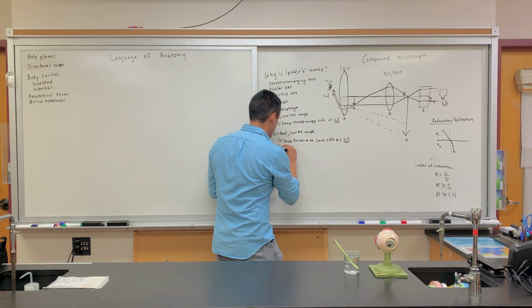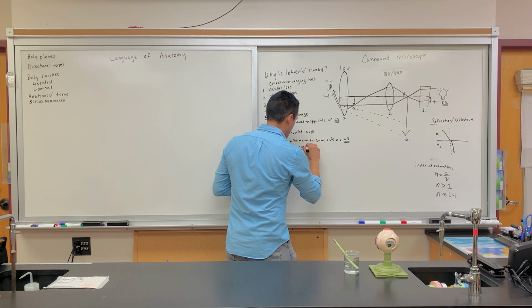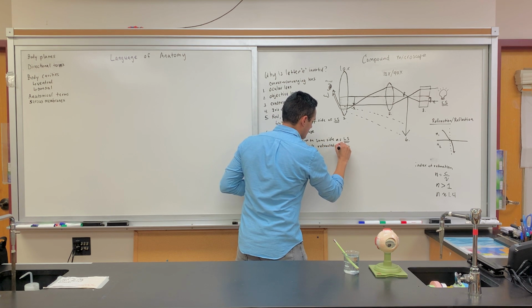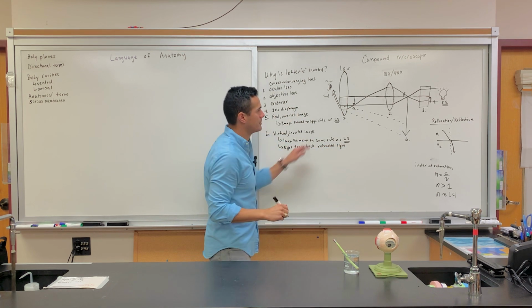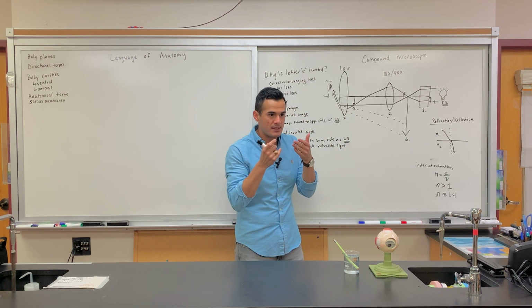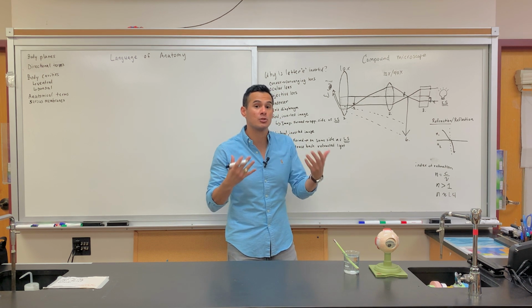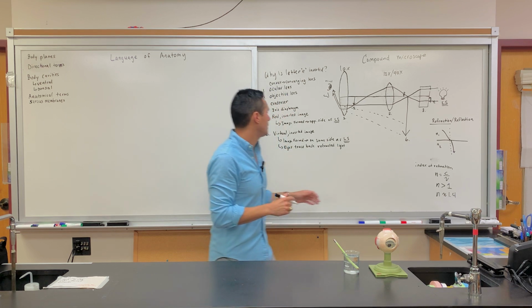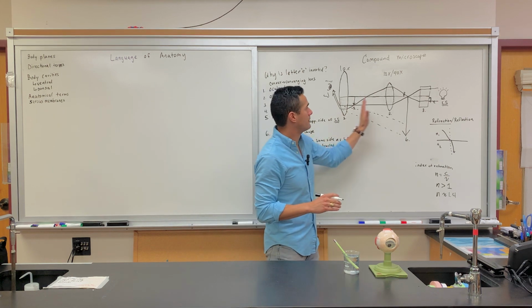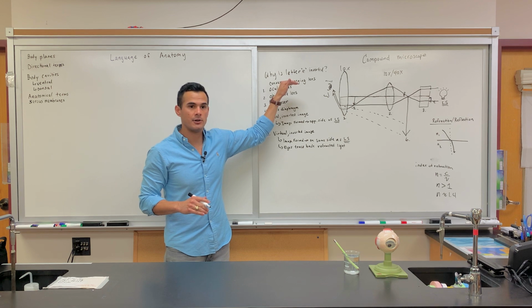So with the virtual image, the eyes trace back the refracted light. All right, so they're tracing it back because this image isn't real. It appears as if it's right where the stage is, but it's not actually there. It's virtual. Okay. So any questions regarding this, of why the letter E is inverted in the microscope?